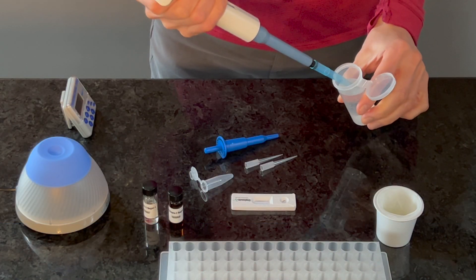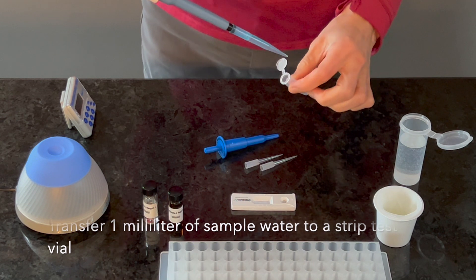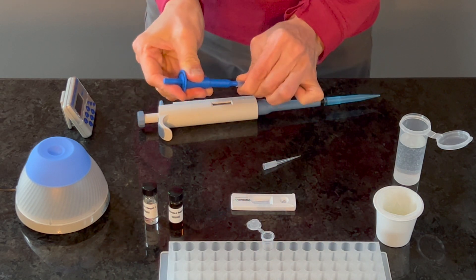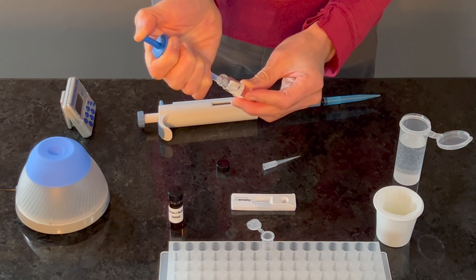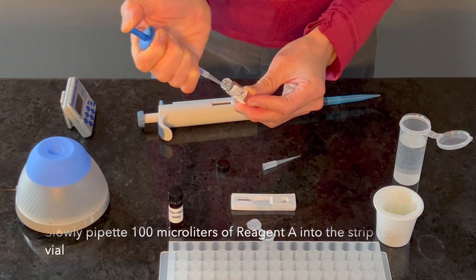To begin, pipette one milliliter of water sample into a strip test vial. Using a clean 100 microliter pipette tip, slowly pipette 100 microliters of Reagent A to the sample strip test vial containing the water sample.